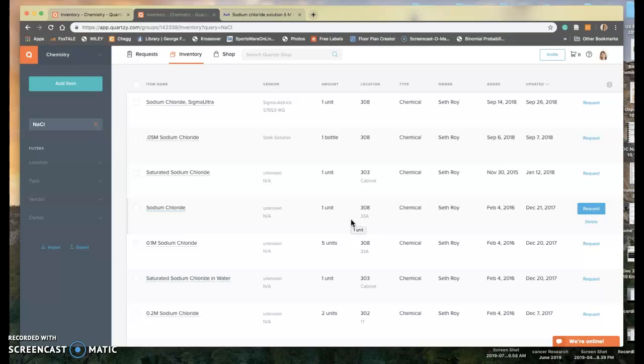A lot of that is going to be up to your own initiative, where does this fit best, where does it go, and just being confident in that. If you are ever unsure though, make sure you do check. We don't want to lose items or put items in the wrong place. We try to keep everything as organized as possible.